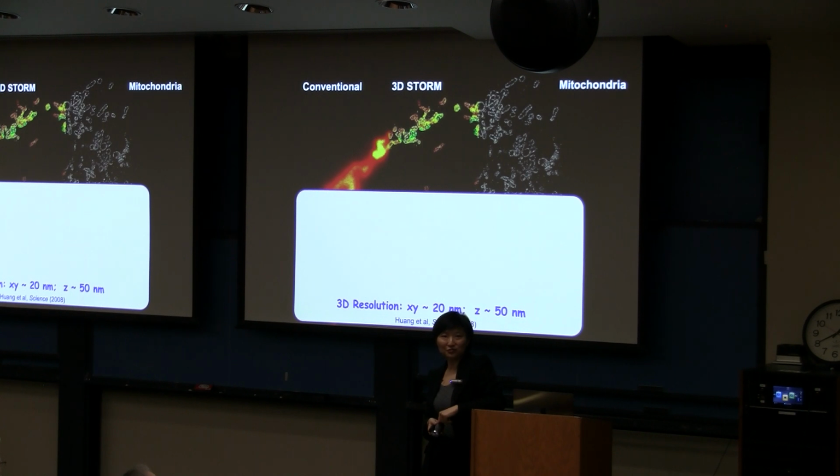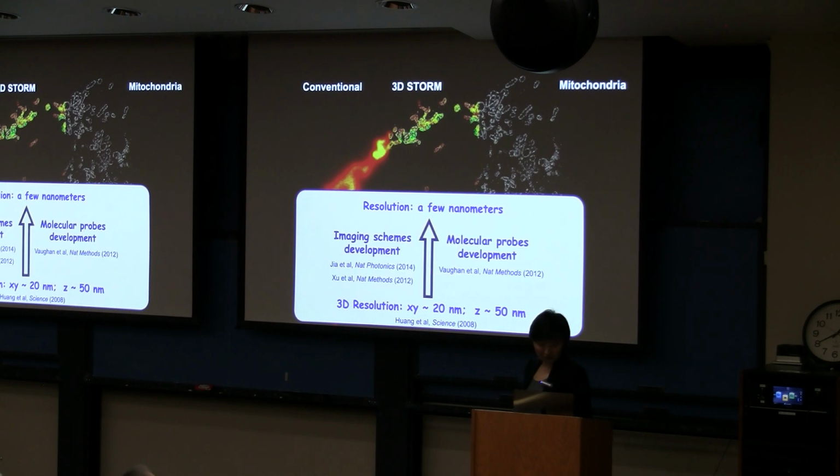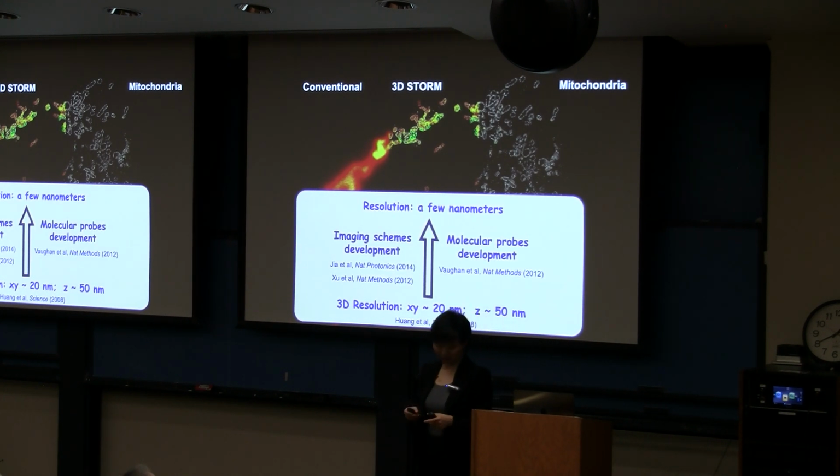And for a physicist, you look at that and say, well, you just told me that the molecular scale resolution is just a few nanometers, and this is a few tens of nanometers, clearly not really at the molecular scale. So then you would want to further improve the resolution. I will not focus on the improvement of resolution, but on the biological discovery.